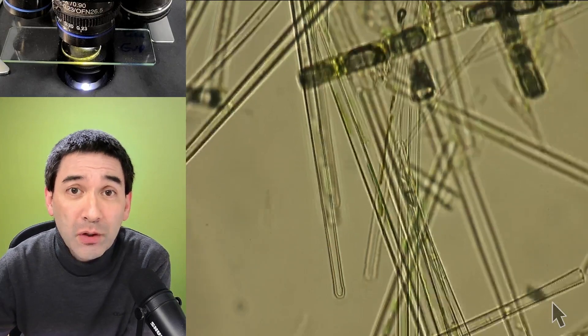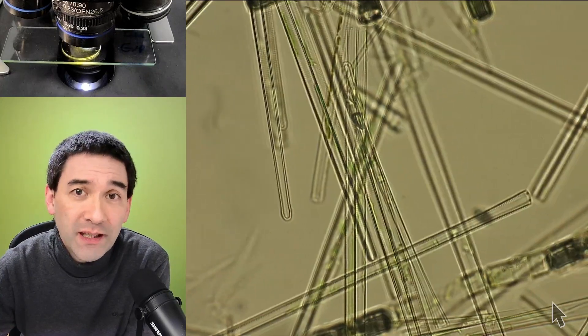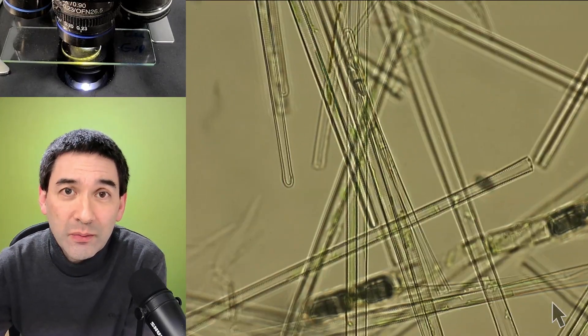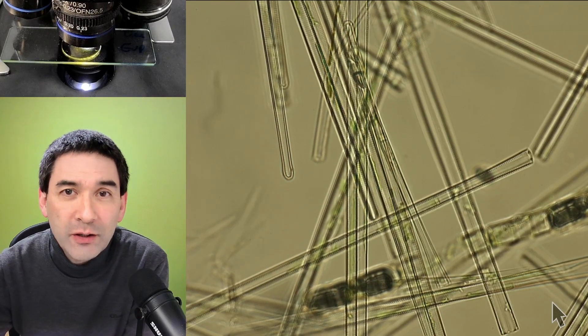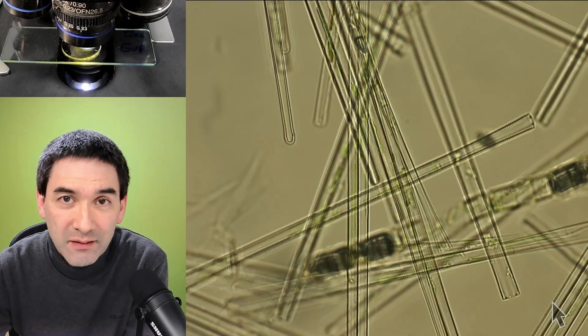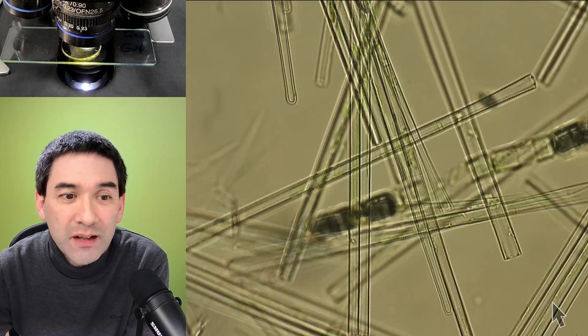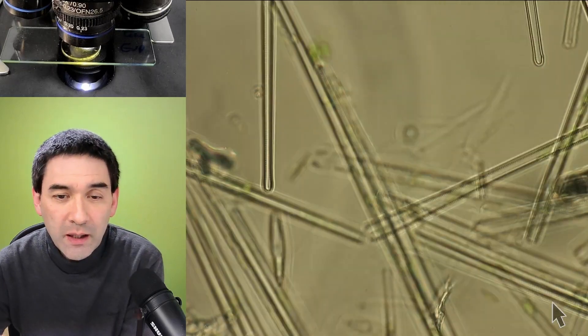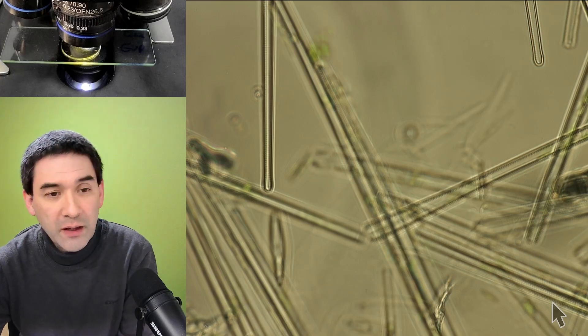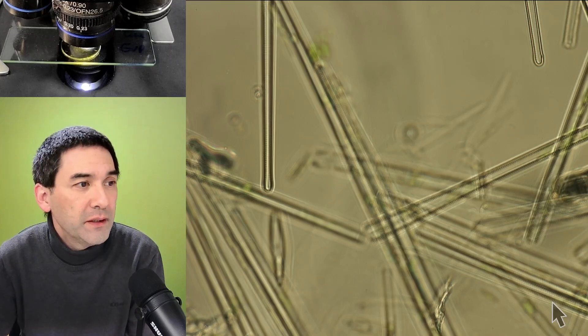Eupro has the nice advantage that the exoskeleton, which is the outer part of the insect, starts to become more transparent. So entomologists, these are the insect researchers, they use Eupro mounting medium for mounting their insects. I just also want to show you now the mounting medium itself that I've been using.